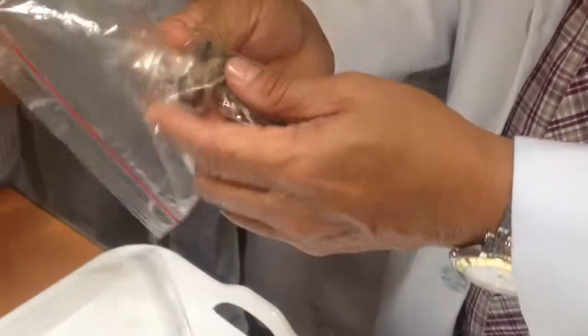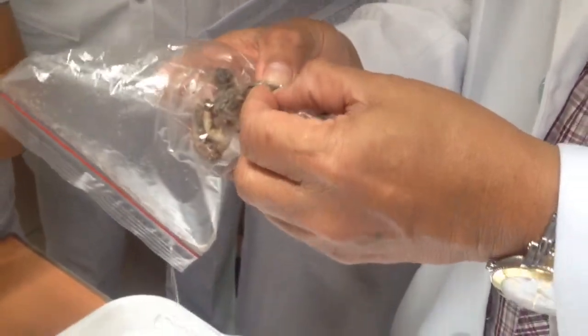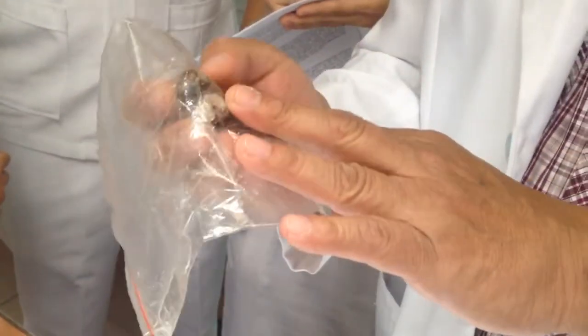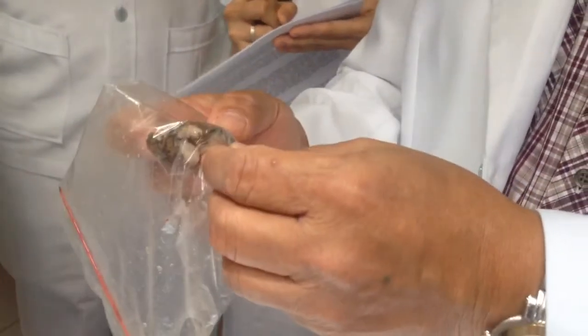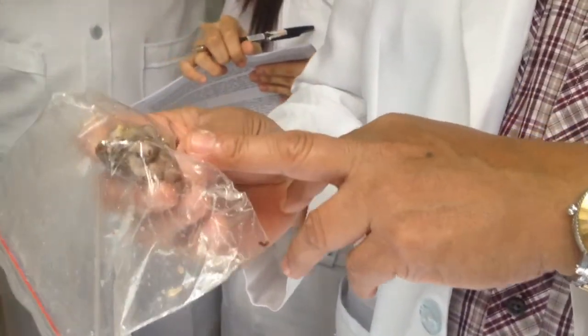If it is in the vulva, it can be a single warty lesion, or multiple warty lesions. And the first consideration will be condyloma acuminatum. So similarly, if it is warty, squamous cell carcinoma is one of the differentials, especially if it is in the cervix or in the vagina.